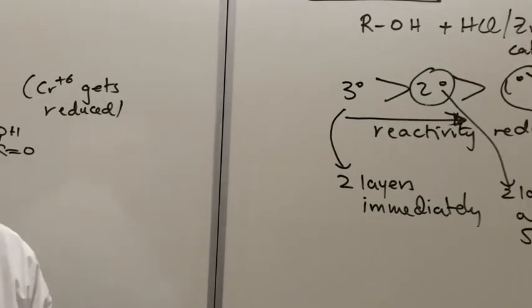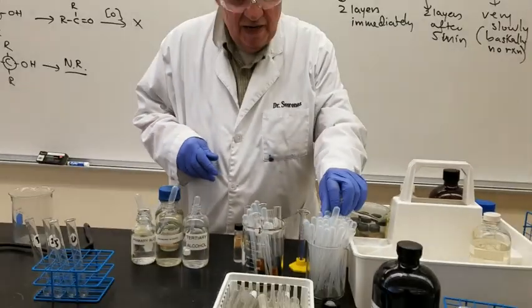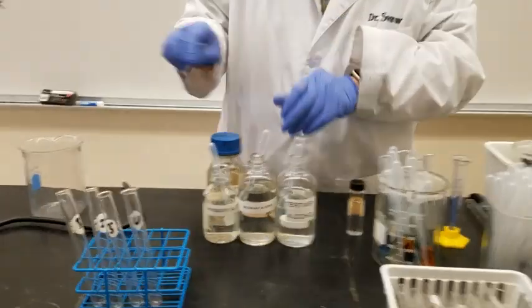Great. So first of all, we are going to have the Lucas reagent, which is this one.